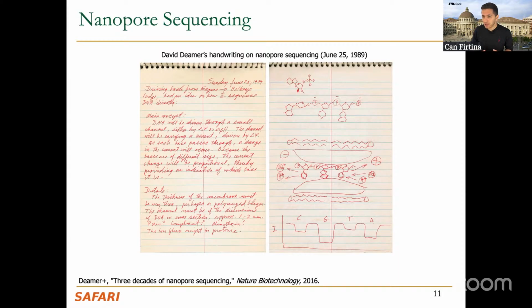And the second one is, as we move this DNA, can we read the ionic currents, the charges that are attached to each base in the DNA?